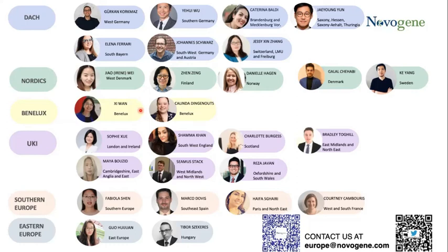And another benefit for the RNA-seq is also to see what is really expressed. So for the WES, we just compare the DNA to the genome, but for the messenger RNA, we check the protein-coding RNA, and that will show what is really expressed. So the purpose is different. Of course, the WES has more depth, and the RNA can be used to study what is really expressed.